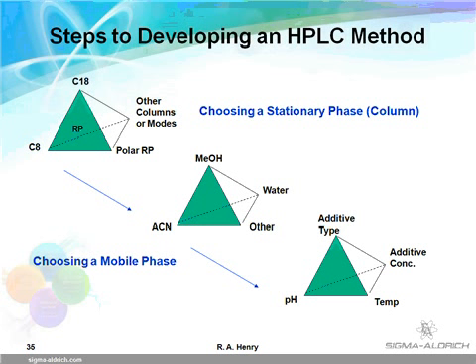It is very important to include water methanol screening experiments when polar RP phases are investigated. The final step is normally an investigation of how additives and temperature influence the separation. Neutral solutes may not require the use of additives such as buffers. However, most acidic and basic compounds will require pH control even during the early screening process.